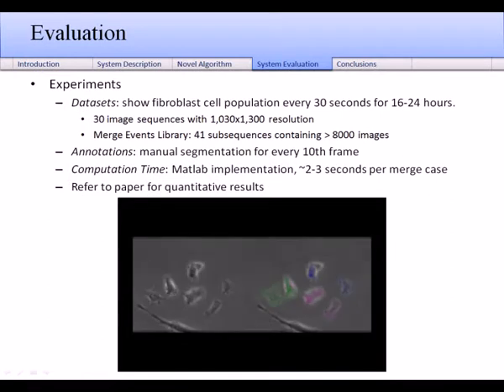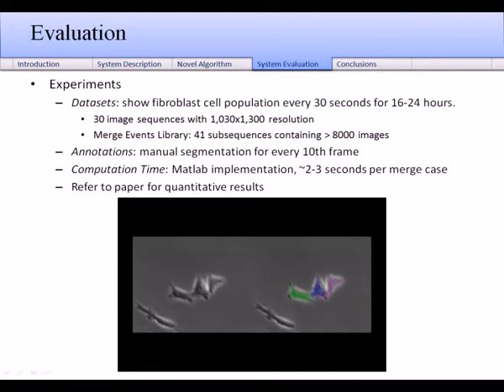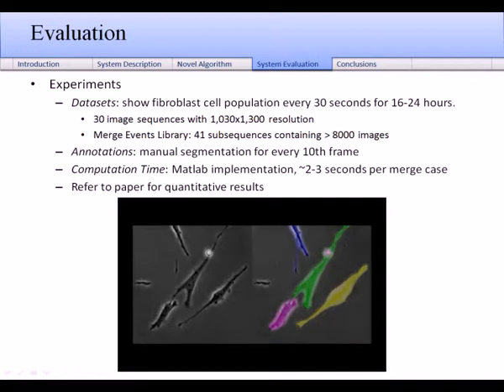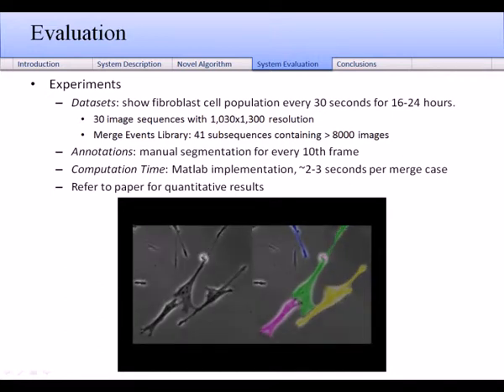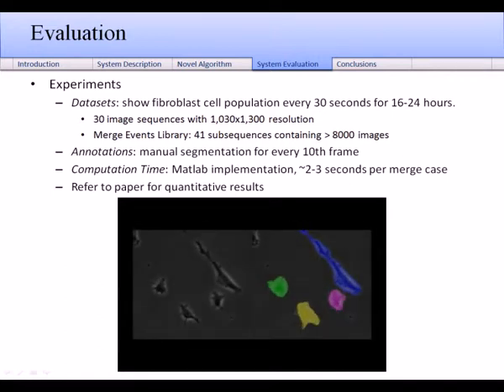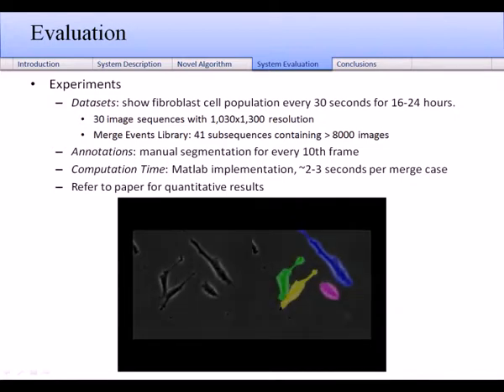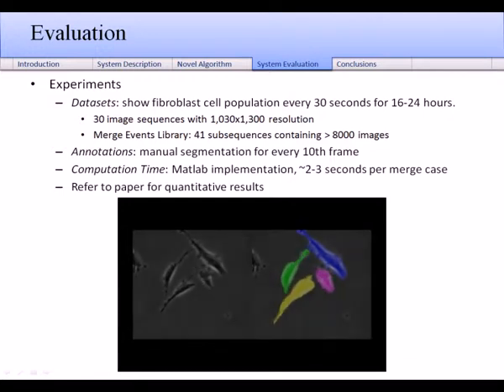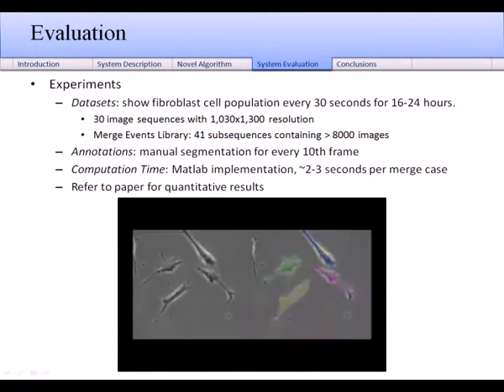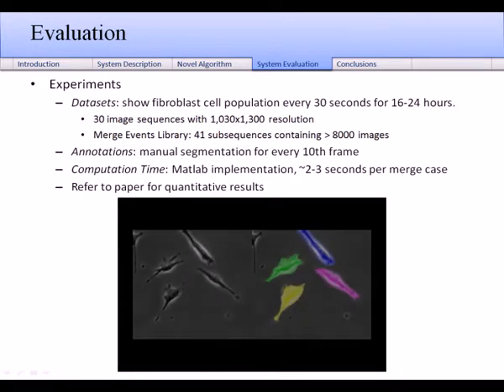We also demonstrated the benefit of our method quantitatively in the paper. Our data source included 41 subsequences containing cell collisions that lasted from 25 frames in duration to over 700 frames in duration. In comparing the segmentation results against annotations, we found our system maintained accurate recognition of cell boundaries across over 8,000 images. Our current MATLAB implementation can process each merge event in 2 to 3 seconds.